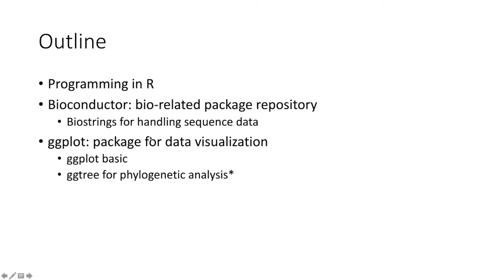And then move on to Bioconductor. As Casey said, it's a package repository, mostly for bio-related packages or for high-throughput data analysis. There are a lot of packages very useful for genome data analysis under Bioconductor, and I'll use one example called Biostrings to show you how to use a package from Bioconductor to do sequence handling, manipulation, and things like that in a live demo. All right.